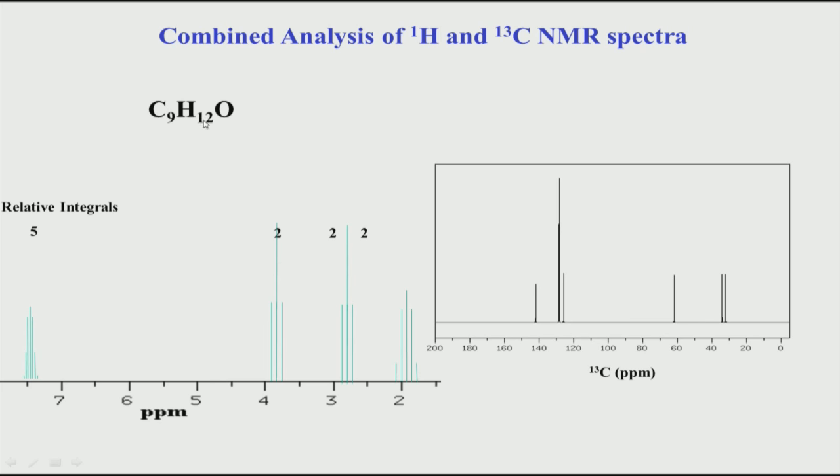Now, if you see here, again there is a single oxygen, but again I do not know whether there is a ketone functional group or there is an alcohol OH and so on. So, how do I find that out? Again, if you look at the carbon spectrum, you see there is no peak here in the carbonyl region. So, that means there is no carbonyl group here, there is no ester. Ester, of course, there is no, 2 oxygens, there is only 1 oxygen. So, there is no carbonyl peak in this region. So, it has to be an alcohol OH.